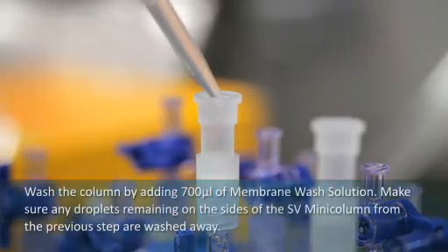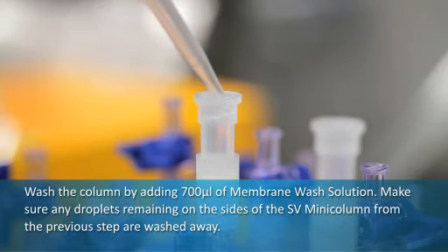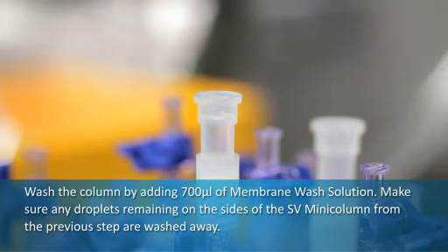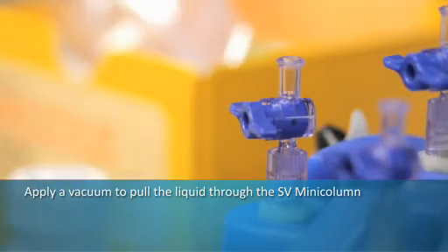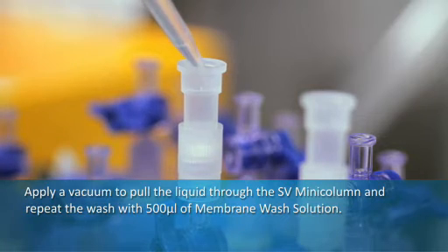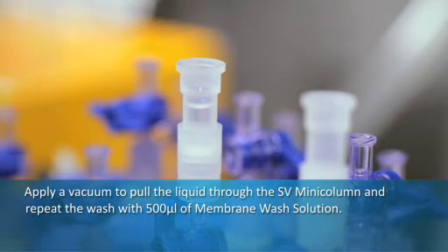Wash the column by adding 700 microliters of membrane wash solution. Make sure any droplets remaining on the sides of the SV mini column from the previous step are washed away. Apply a vacuum to pull the liquid through the SV mini column. Repeat the wash with 500 microliters of membrane wash solution.